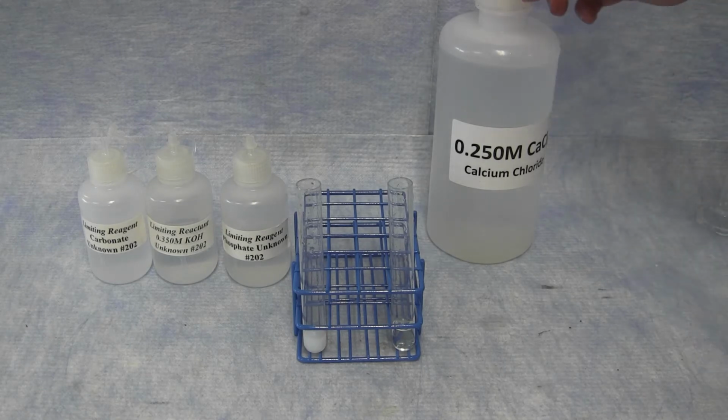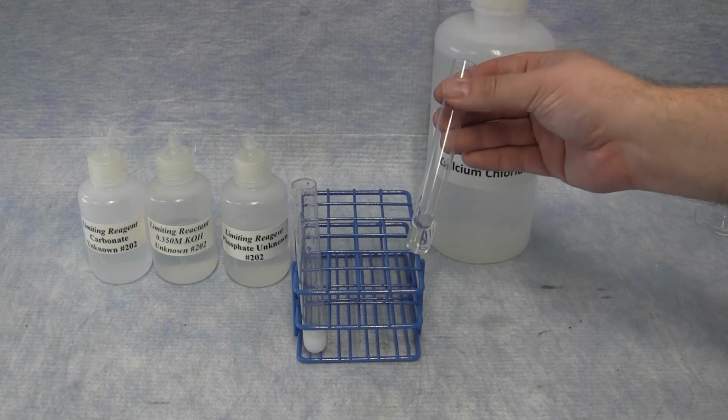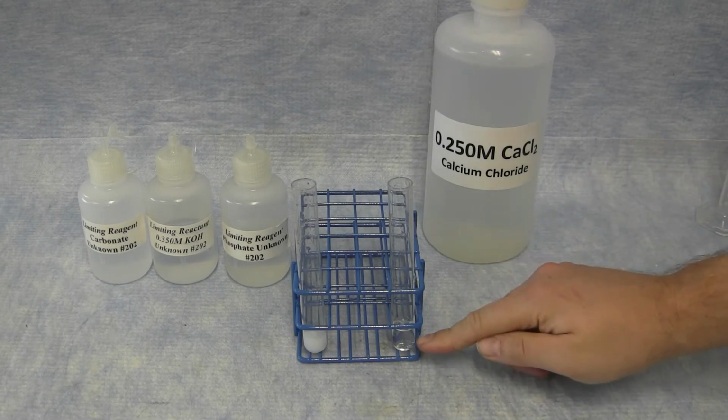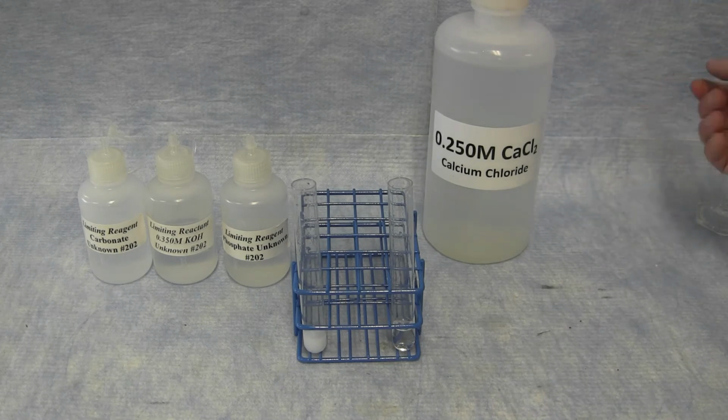In this case, additional calcium chloride did not give any additional reaction. This means there was no carbonate present in the filtrate, and the calcium chloride could not react.